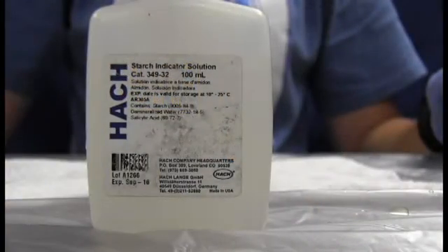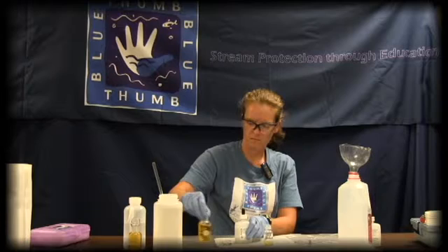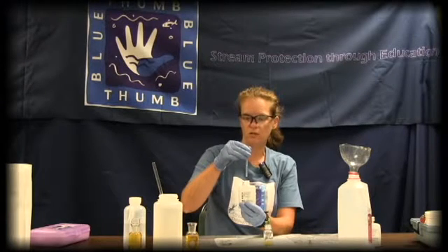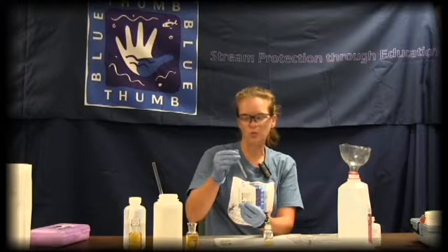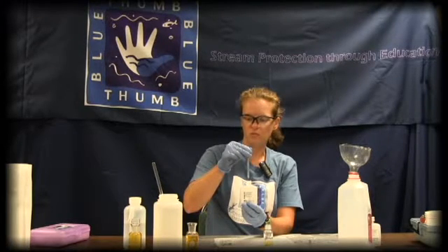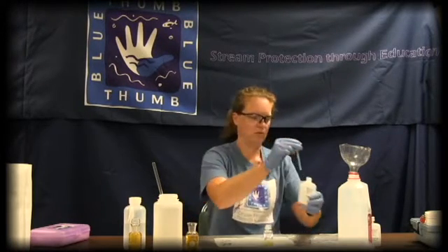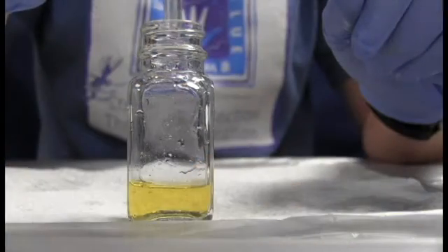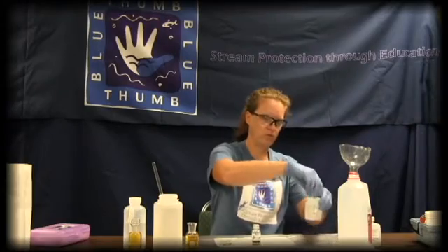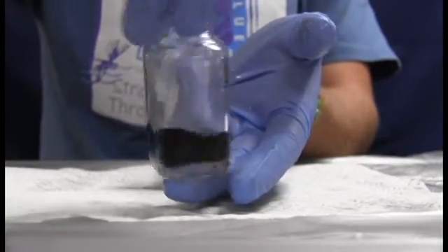Then start with your starch indicator solution first. These bottles are child-proof, so you have to push down and twist. Always hold the dropper straight up and down — any angle gives a different-sized drop. Make certain the dropper is at least half full, because when it's nearly empty you don't know if you'll get a full drop. Add two drops of starch indicator solution to your square mixing bottle, then screw the top back on. Swirl the bottle until it is all completely one dark color.